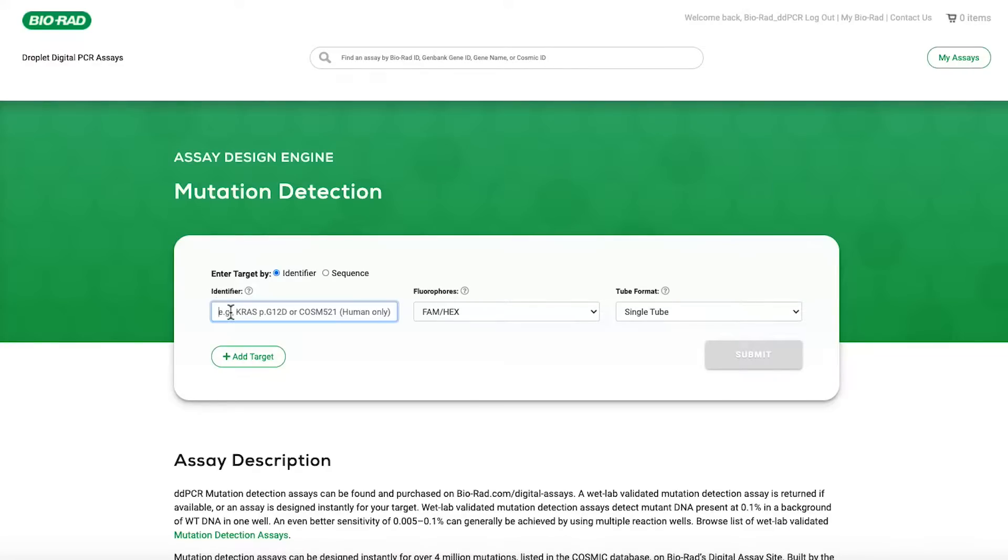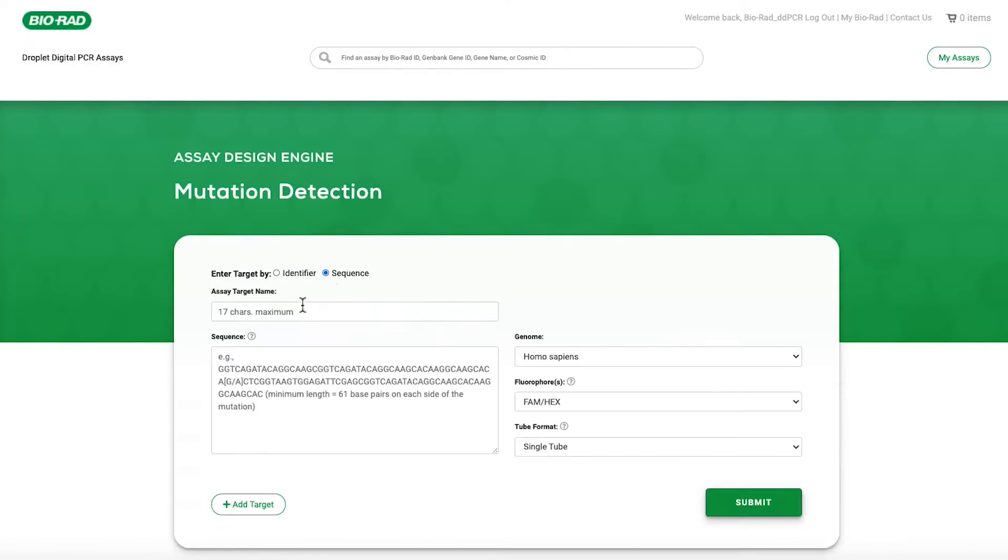You can create a custom assay by entering the unique mutation identifier or by entering the exact sequence to be tested.